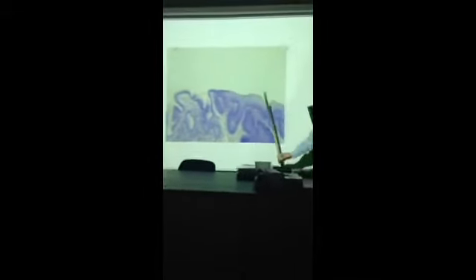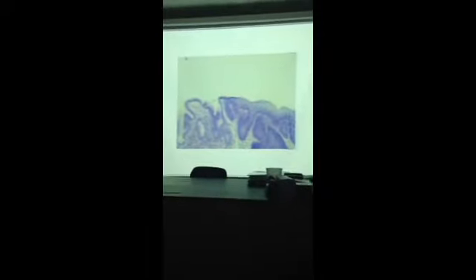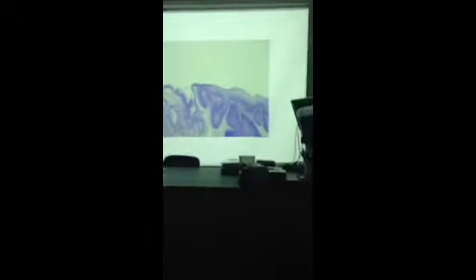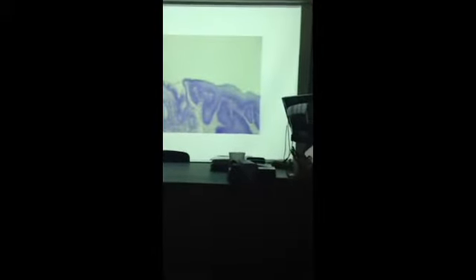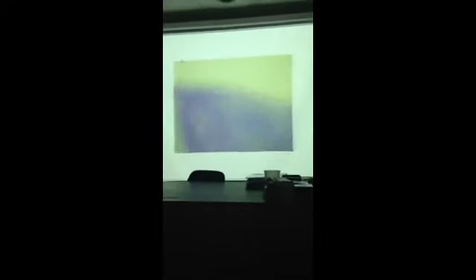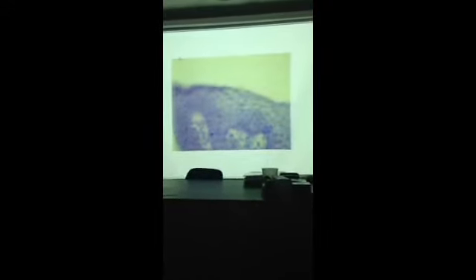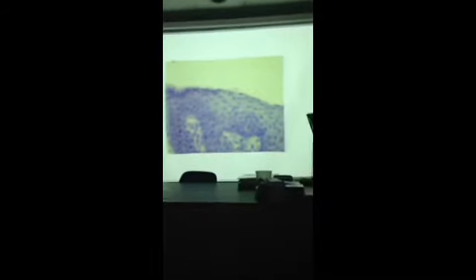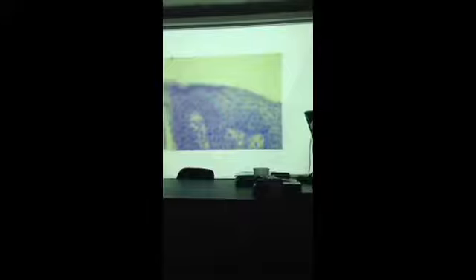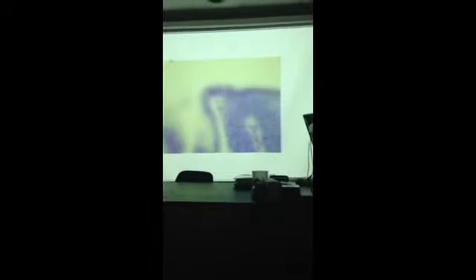And to the left, you can see we're going into another type of epithelium, and that is simple columnar. This is what you see in the stomach. Okay. So here again, non-keratinized stratified squamous. We move to the left. You can see the epithelium changes.